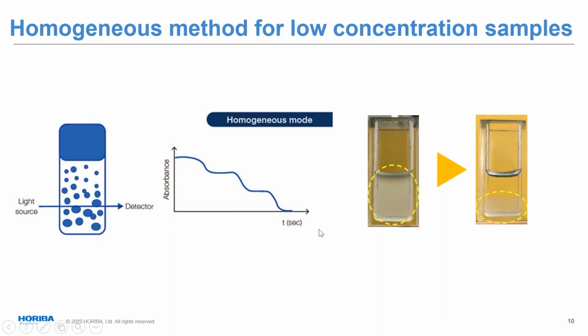But the other thing I want to point out to you on the far right there, that's kind of important, is that you take notice if you look at the bottom of that cuvette, that's where all your particles are. And those particles have seen a lot of centrifugal force, especially if you spun it at 18,000 RPMs, you're talking about thousands of Gs. Don't ever try to just shake up the cuvette and run it again. You'll never get repeatable data. Agglomeration happens, particles stick to the bottom of the cuvette, the walls of the cuvette. So when you go to do a sedimentation type experiment, typically you want to just throw the sample away, clean it out, and go on to a second sampling from your original material. Don't try to reuse it because that's going to give you some lousy data.